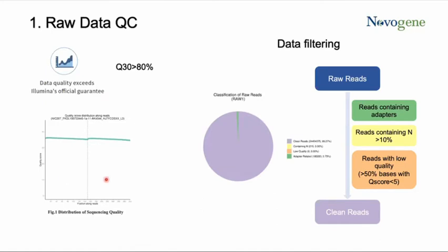Left and right show read 1 and read 2 if you ordered paired-end sequencing. For NGS platforms, it's very common that we get lower and lower quality as the read elongates. So this is quite common.